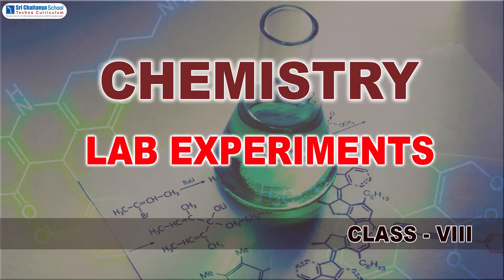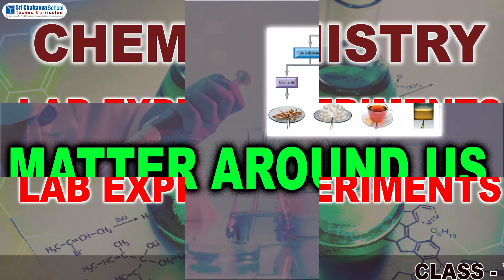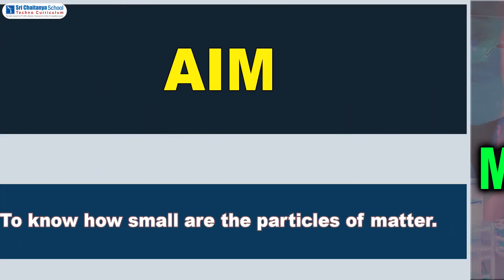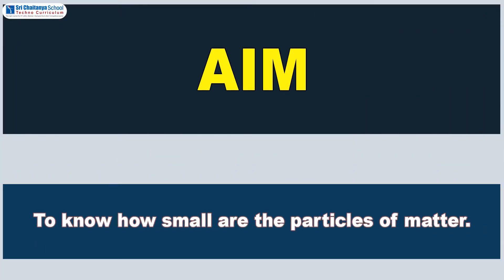Hi children, now we are going to do a chemistry lab experiment and the lesson is matter around us. The aim of this experiment is to know how small are the particles of matter.